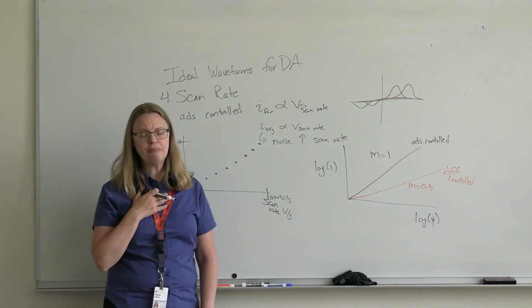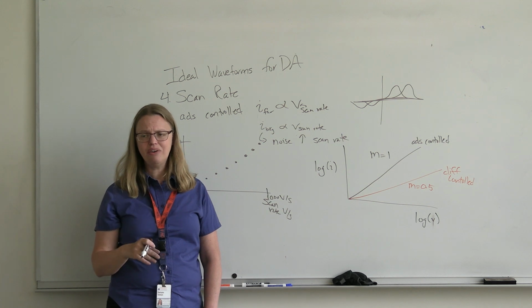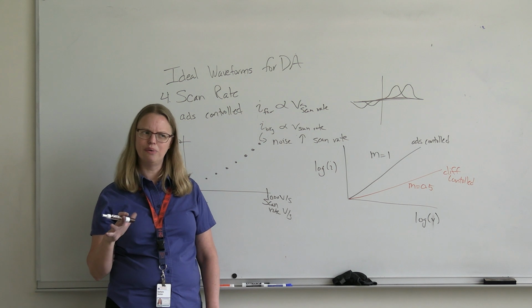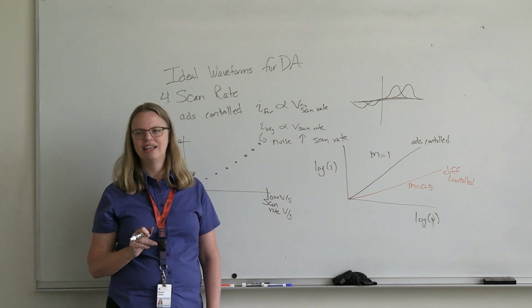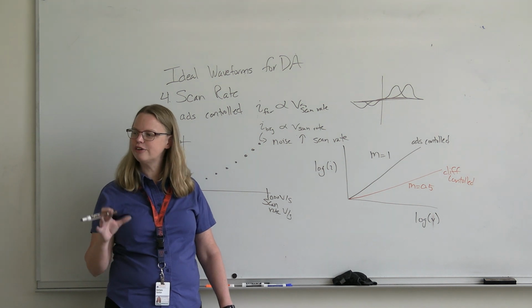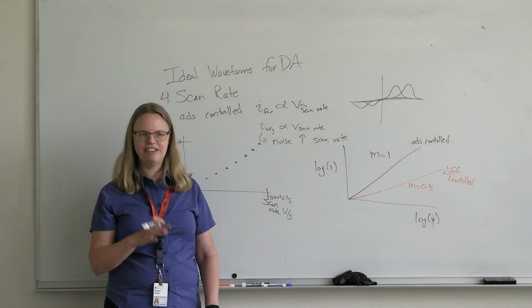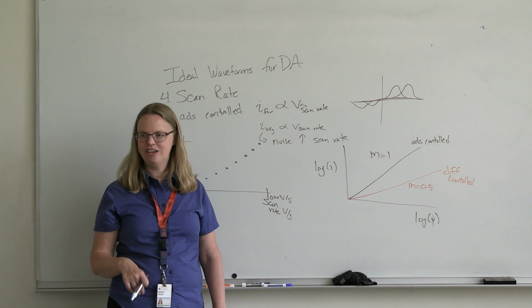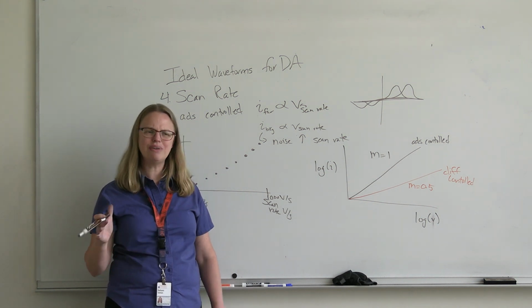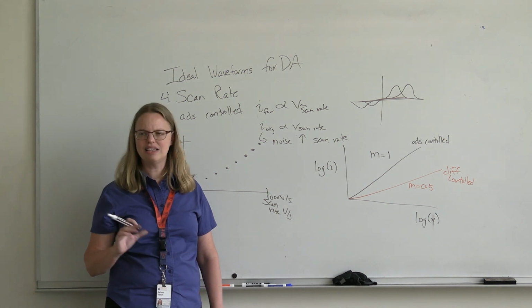I also believe from my practical experience that in vivo, I've seen a lot less stability with waveforms that we tried to run at like 1,000 volts per second. I don't know if it causes the neurons to fire or what's happening there, but I don't like to go much more than 400 or 500, 600 volts per second. The serotonin waveform is the exception. That one seems to be fine and stable at 1,000 volts per second.